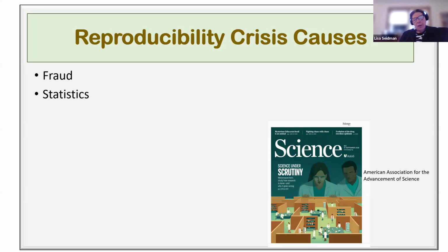To some degree, I think we are actually teaching our students a little principle there by telling them that they need to record on the blackboard their own data, whatever their data truly is, and not to change it because they think it might be wrong. Statistics is something I would not probably cover. The statistical problems they're seeing are past what I would be covering in a basic lab course.